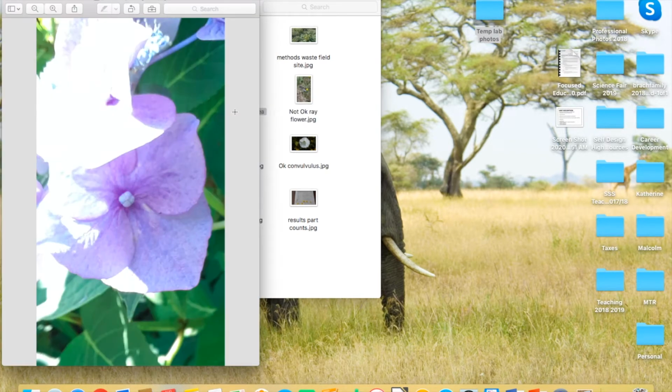You also do find weird things when you're looking in a flower garden. There's a few things around. Here's a plant I wouldn't use. What's wrong here? Well, we got petals, but there doesn't seem to be a whole lot going on in the middle. Either this flower hasn't matured, or maybe it doesn't even make those sexual parts, because maybe it's just a garden variety that doesn't do that. I don't know. I wouldn't use this for that lab.